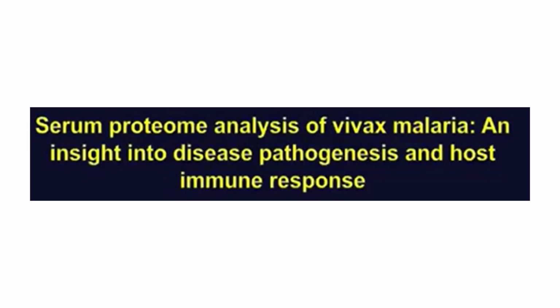So how can we determine whether a person is suffering from malaria using a proteomics based study? You need to have a healthy control and a person who is suffering from malaria. And if it is malaria, which kind of parasite is exactly affecting can also be determined using proteomic analysis. So you'll need serum of that specific, if you all know the malaria life cycle.